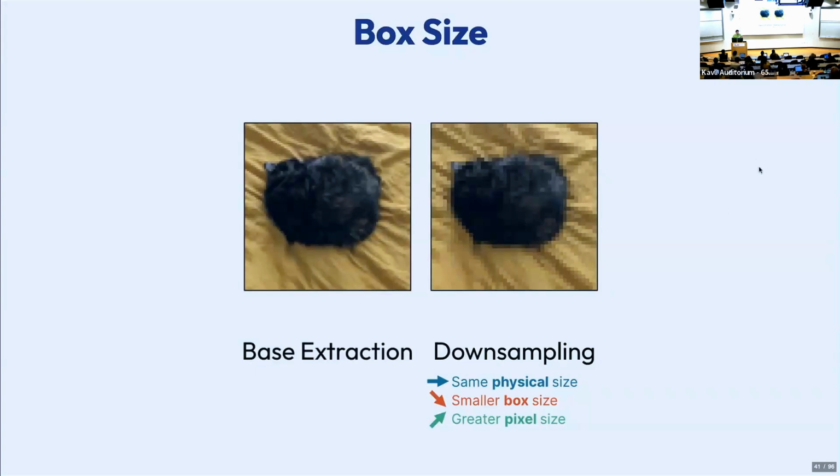So this is the big thing that I want you to take home from this slide. I think it's tempting to say, well, I always want to get a high resolution map at the end, so I always want to extract a full size pixel. I would recommend you don't do that. I would recommend you always start by extracting with a pretty downsampled box so that things are fast in those early stages where you don't care what the final map looks like. You're just trying to find the good particles. And we'll talk about this more in the case studies. And then once you've found the good particles, you can re-extract, right? You can go back through with your cookie cutter, but only cut out the good positions and do those at full size.